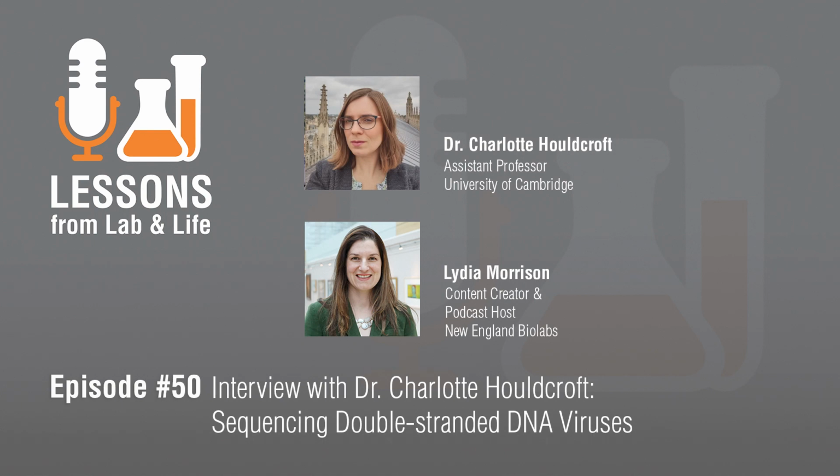But then in contrast to this, I might have been working with samples from eye infections or samples from blood where an individual has a viremia, they have virus in blood. And there you might find that the host DNA component is very high and the viral DNA component is very small. So there might not be very much virus there, or it might be low mass depending on the sample. And that's the situation where going in with bait-based enrichment, and there's now lots of different technologies and brands for that, is very powerful. It's very, very sensitive, but it tends to be perhaps a little bit slower. It can be, depending on the method, a bit more expensive, but you get beautiful high-quality genomes back.